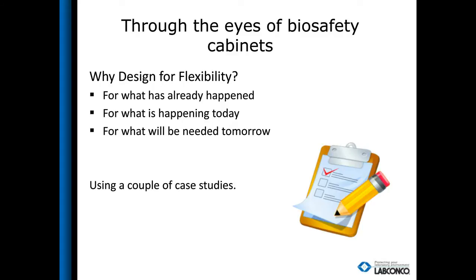This is Brian Garrett, and what I'm going to be looking at is using flexibility or looking at equipment selection for lab managers and safety officers once you have cataloged all of the information that Matt spoke about and that's been communicated to the design team, how flexible equipment selection can improve a building's design or maintain it for the future, all for the purpose of keeping that building, that investment going for as long as it can and maintaining efficiencies. So with that, there are numerous types of equipment that can do this.